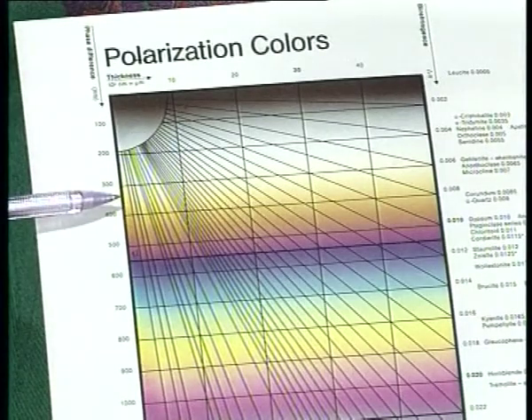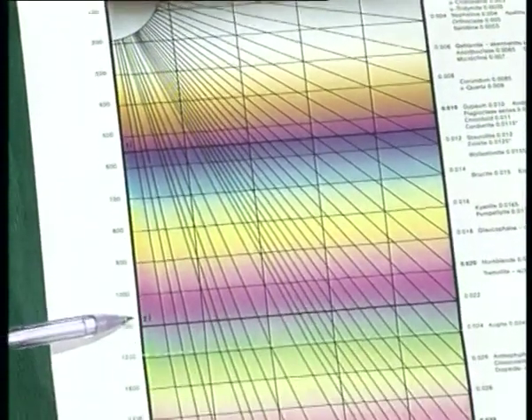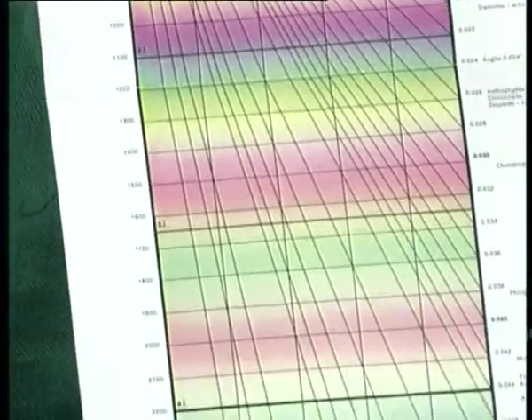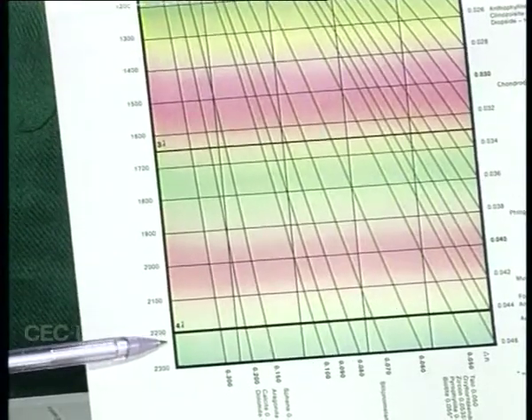We can assign the order of interference color of a mineral by comparison with a standard chart of interference colors. First order colors, namely gray and yellow, are dull. Relatively, second and third order colors are quite distinct and bright. In higher orders, the colors become less distinct. Larger the birefringence of a mineral, higher the order of interference color.